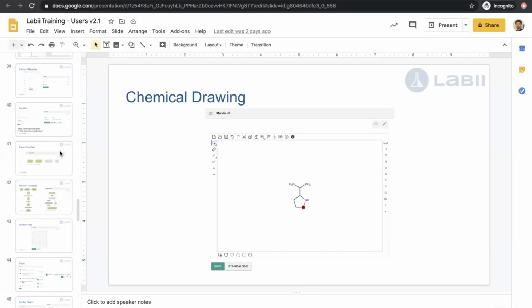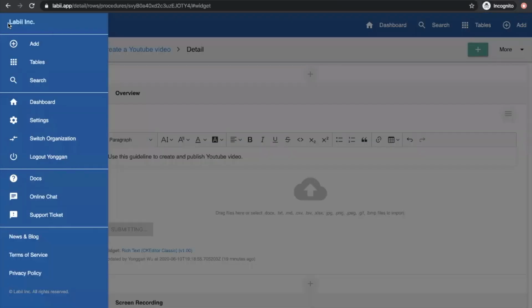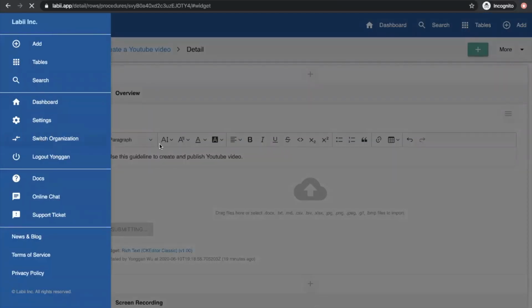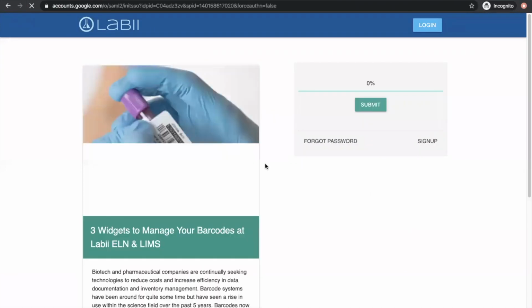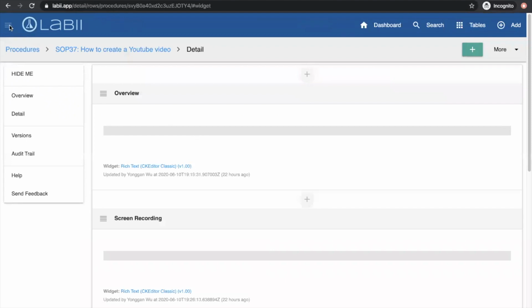And then no one else can change it for you. Okay. So, to expand on that, there are a couple of ways you can do it. We've been using teams and allowing a team to edit a project because it makes sense; we have different teams, so they can view and edit. The easiest way is to make a separate project if a single person only wants edit capacity for themselves. Yes, that's right.